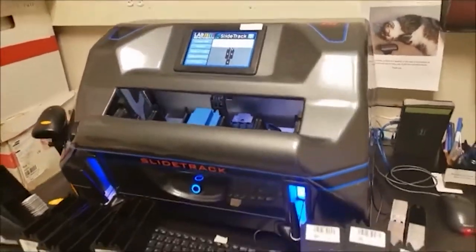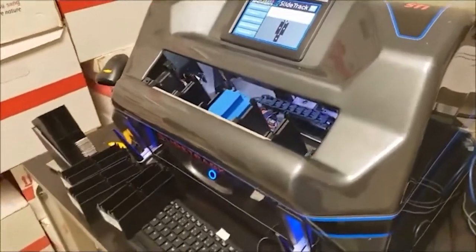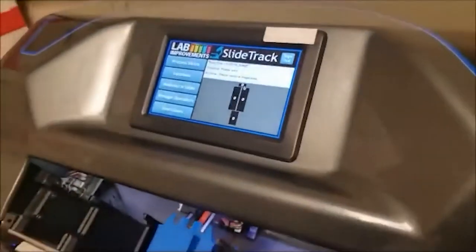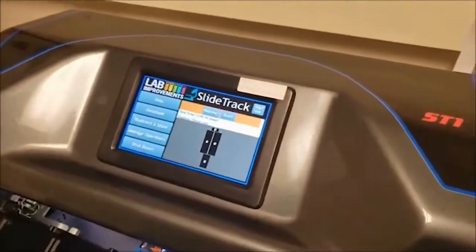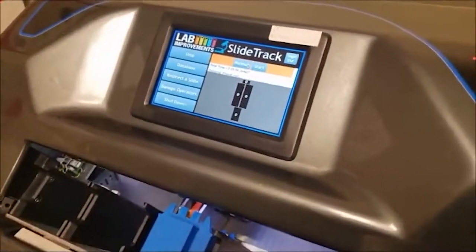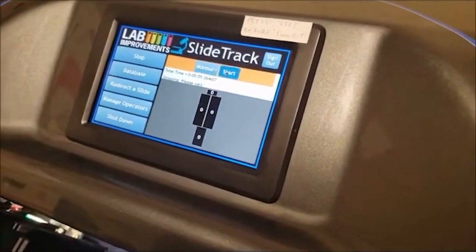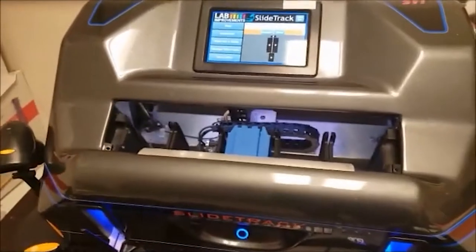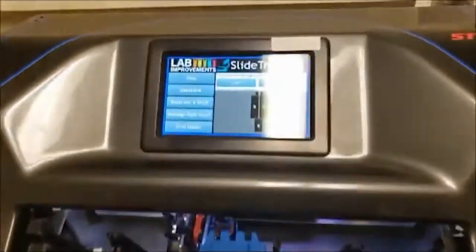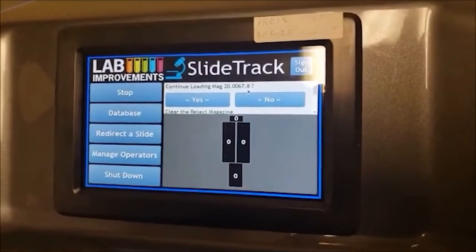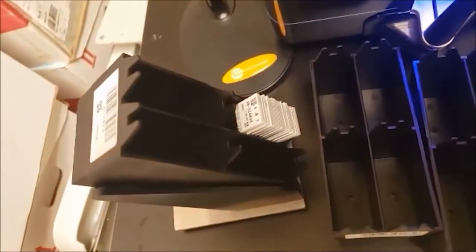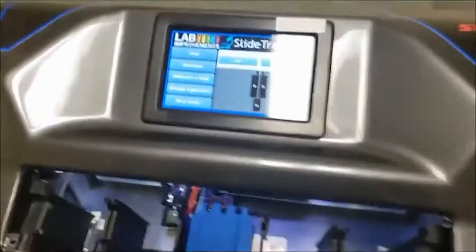Part two of our adventure is here with the actual SlideTrack machine. We're going to simulate coming in first thing in the morning — the machine had previously been shut off. It boots up to the main screen, and we're going to process slides. We'll go for normal processing, where you can have certain modes — say you wanted to only process cytology slides, or reload a magazine. The machine slides up, robotics home, does all its start checks. It's going to ask: do we want to resume the last magazine? The last magazine we were working with was year 20, box 67, magazine 8. We had a magazine that was partially filled up the previous day, so we're going to say yes.